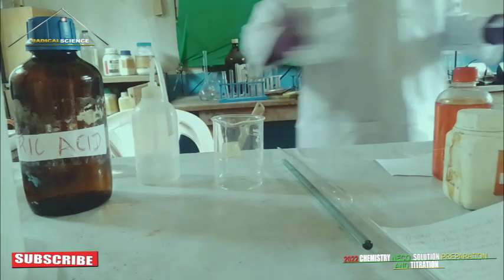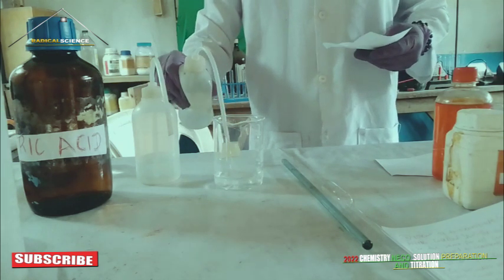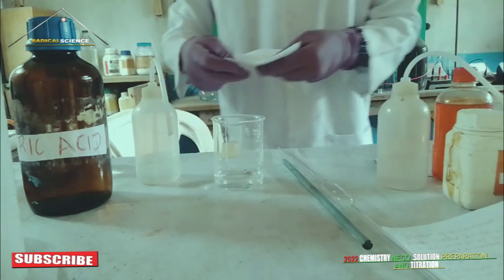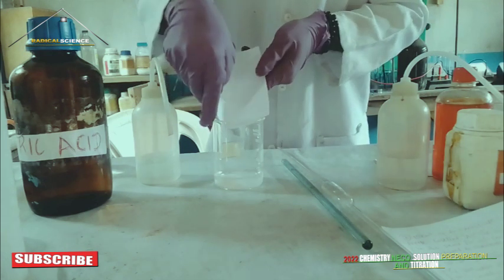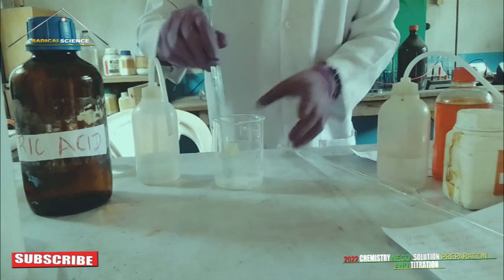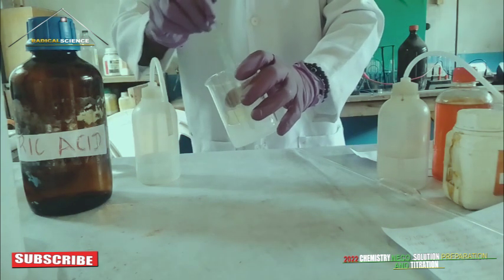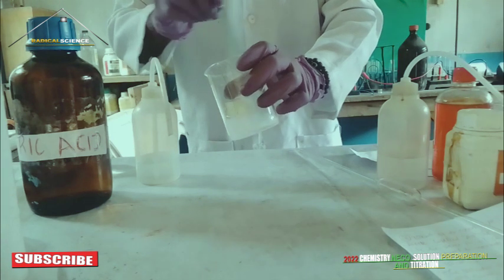All we need to do is add some water here. Now we use this to dissolve it. As we dissolve, we use our stirring rod to stir, just to make sure that it is properly dissolved.